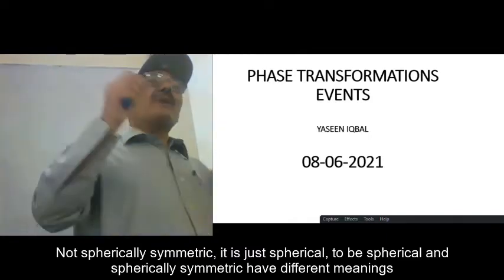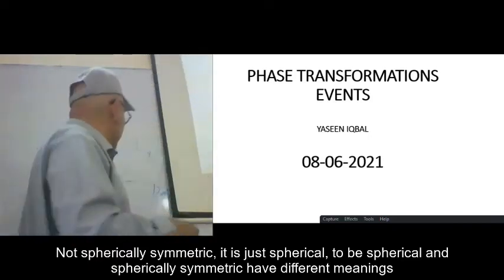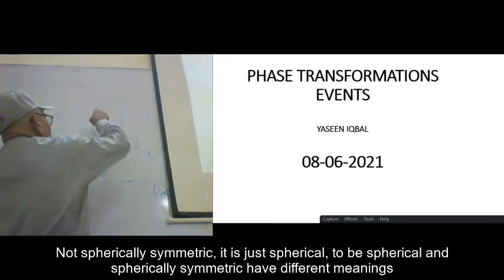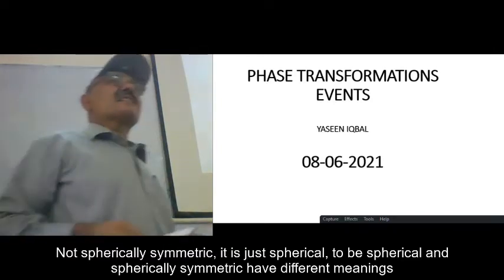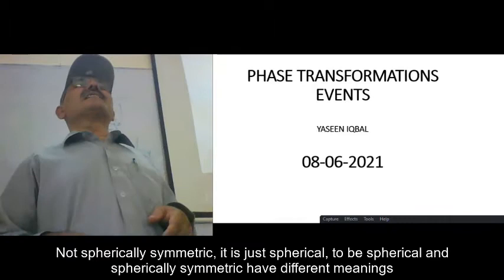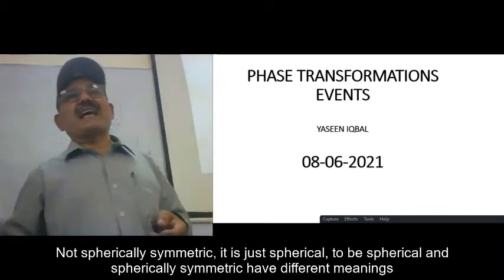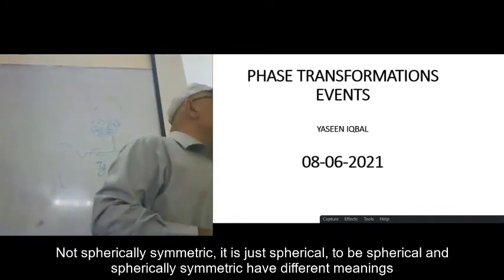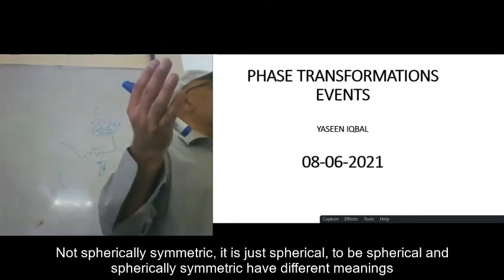You may melt something completely, but what happens? This is the pot, the crucible, in which you put the glassy material. This glassy material contains iron oxide. This glassy material contains potassium oxide. It contains calcium. It contains magnesium. It contains silicon. Different sorts of material will be there.